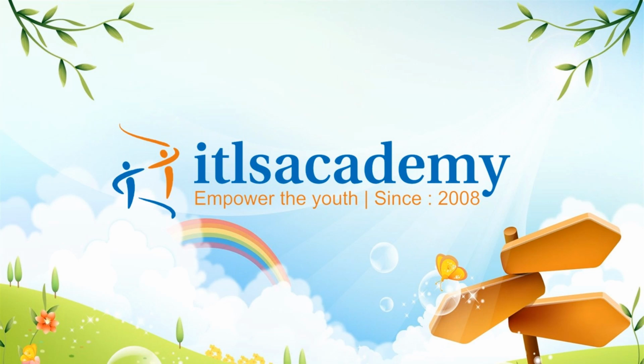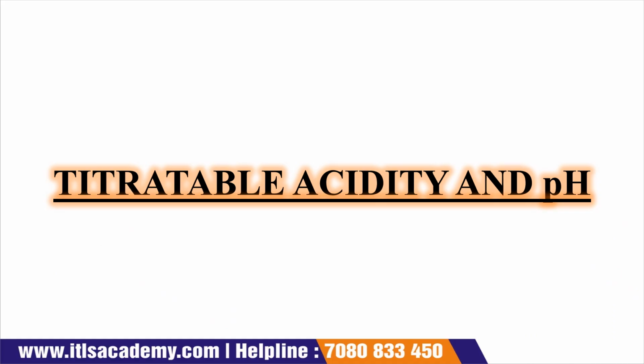Today we are going to discuss titratable acidity and pH. Before starting the lecture, first of all, I just want to give a quick definition of titratable acidity.